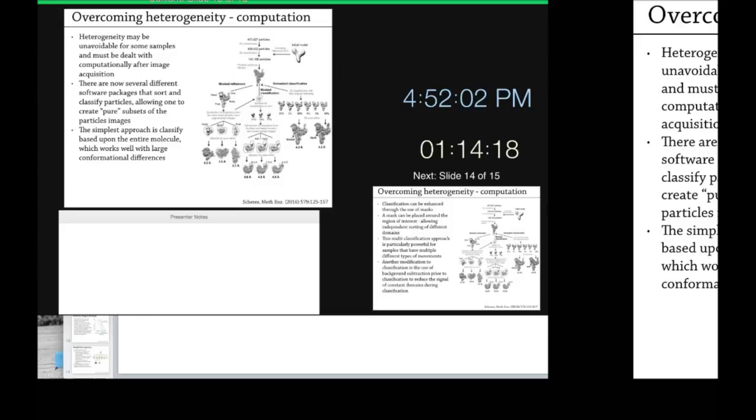It may be that it's slightly different. From here it looks like this whole domain is gone. See right there versus here, here, and here? Yeah. This domain just seems to be entirely missing in that 25% particle population.